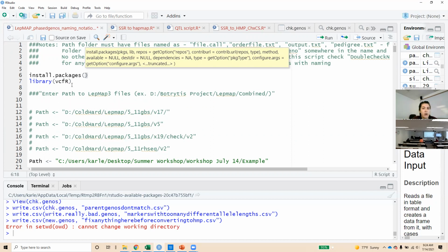And then when there's stuff already listed after the equal signs for some of these, that means there are defaults already designated, and it's pretty likely that unless you know you need to change it, you don't need to change it. So I just need the package name for this install.packages function. And I'll put that in double quotes because it needs it as, I'll explain in a second.